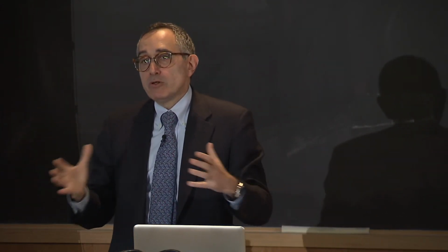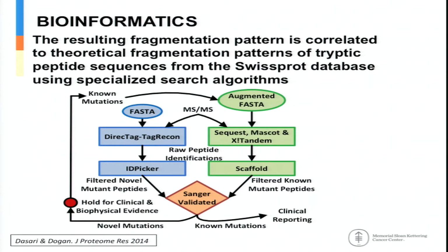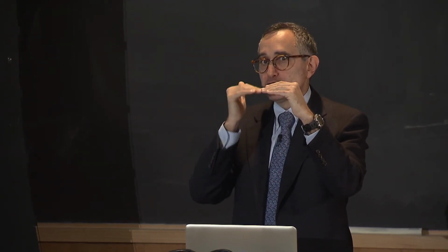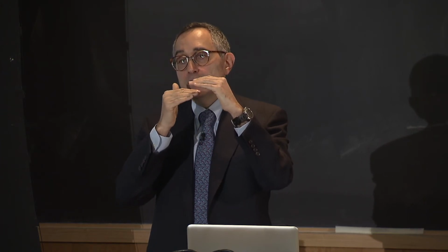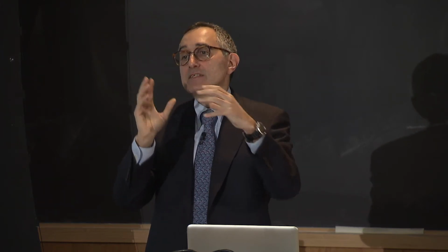Now, once you have developed all that mathematical information about the fragmentation pattern, you have to assign a meaning. And this is done by using bioinformatic algorithms, which interrogate the fragment information against a theoretical fragmentation based on a reference database. So that is really the critical part of that. That's sometimes a weakness. Your detection ability heavily relies on how good your database is. And your database should be specific to your disease question. If you use the human genome version 18 or whatever as your protein database, there are certain gaps that may not be addressed in a certain clinical situation.